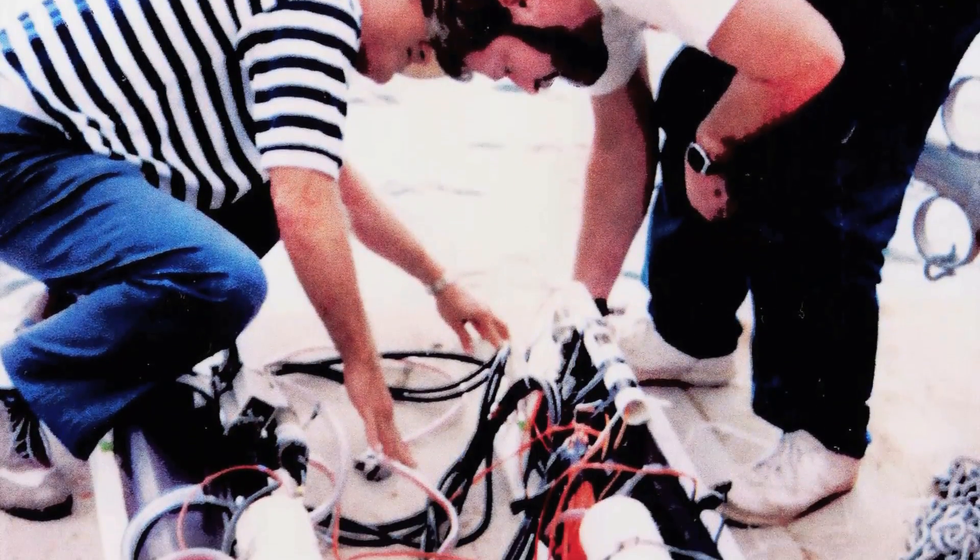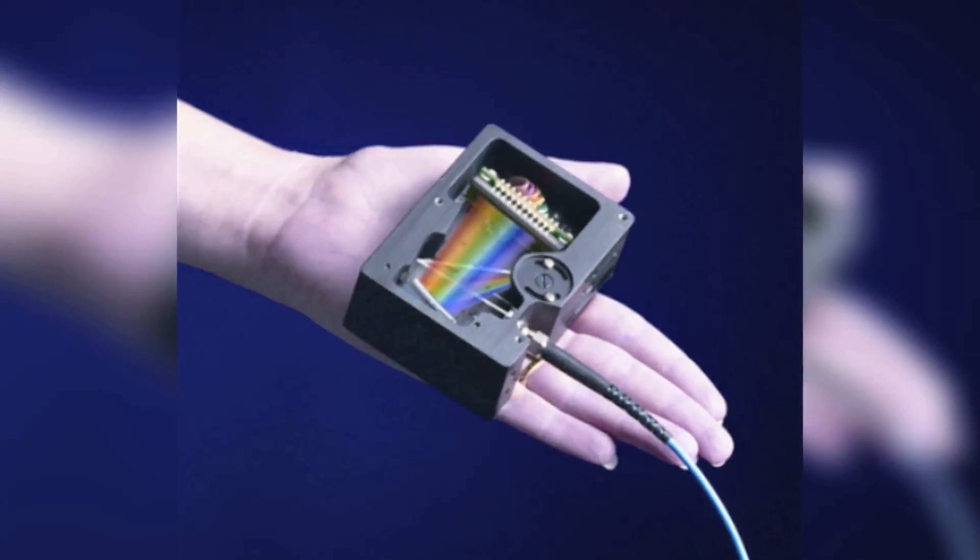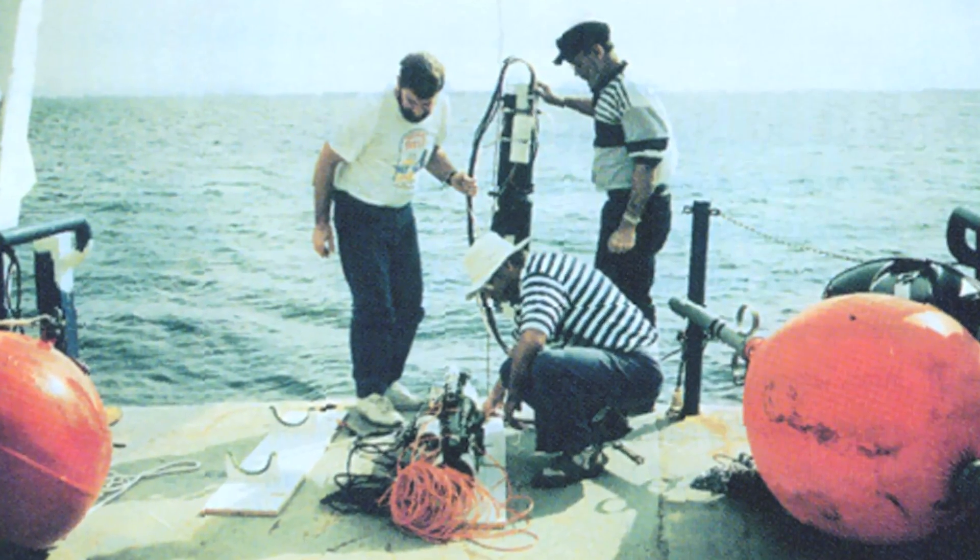The first measurement OceanOptics ever made was an environmental monitoring measurement. To make our measurements we had to have a spectrometer that would fit inside a buoy so we could monitor pH in real time to look at ocean acidification.